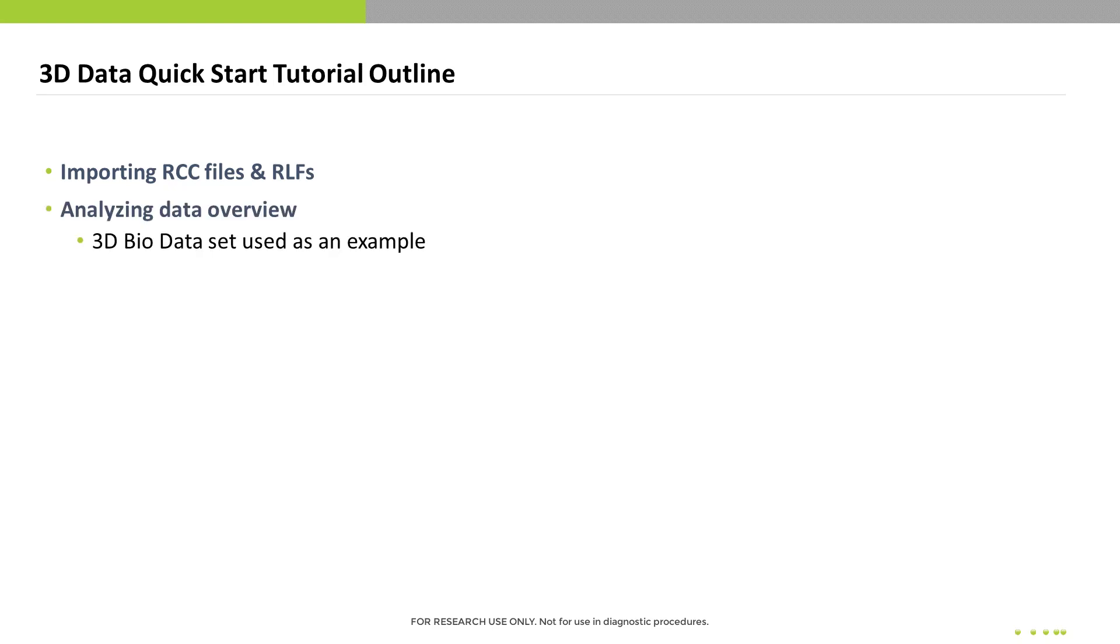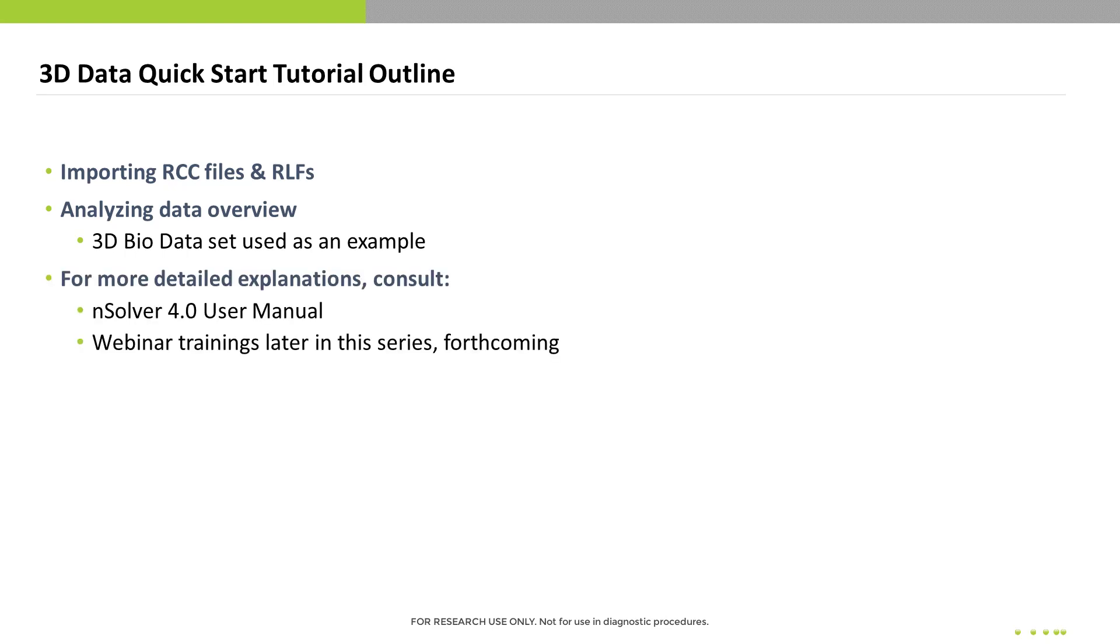Then we'll go through the process of analyzing data, just touching on each step lightly. We'll use the practice dataset that is included in your NSOLVER download, the 3D bio dataset. For more information on any step that we cover here, you'll want to consult the NSOLVER user manual or see more detailed trainings which are forthcoming in this series.